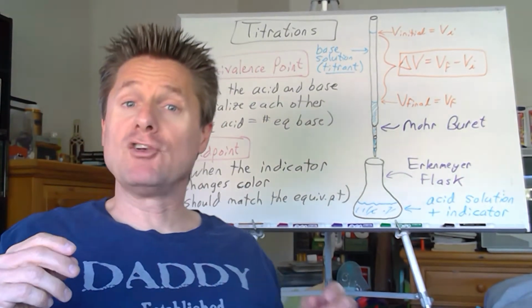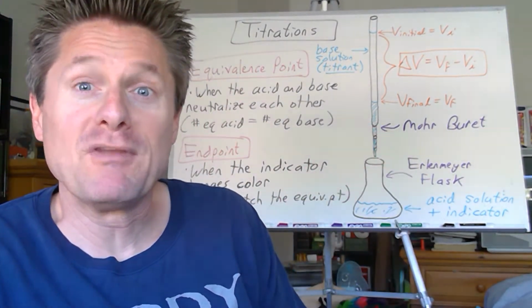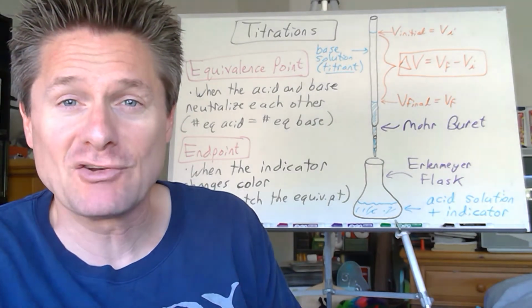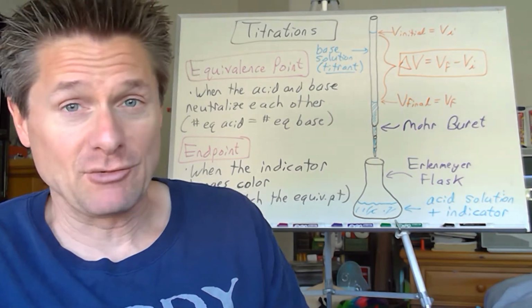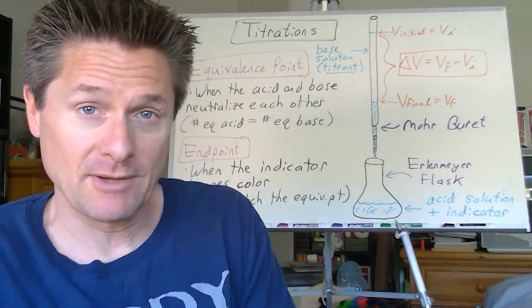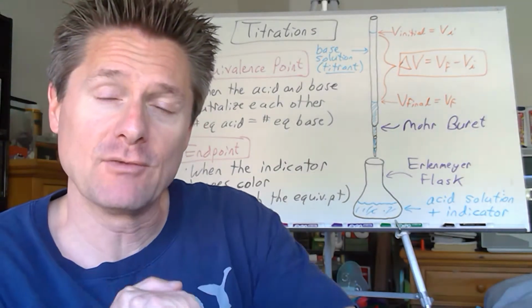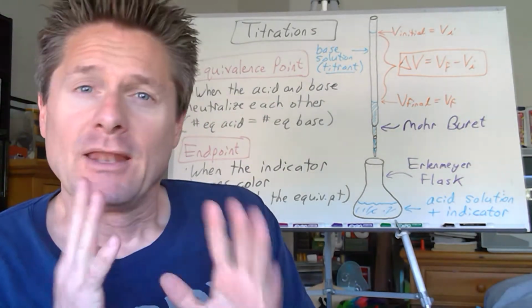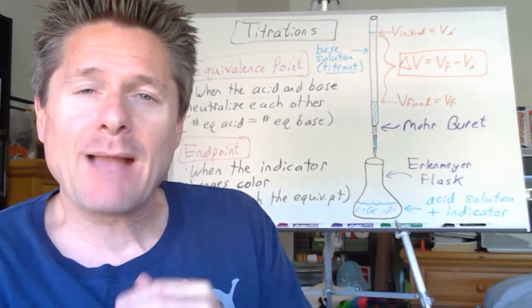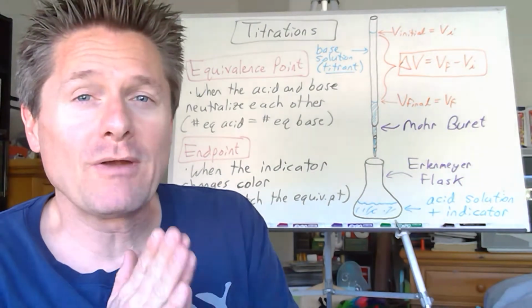So when we are doing titration, this is just a messy board here with a little review from last semester on what a titration is, which I'm assuming all of you did in introductory chemistry or first semester general chemistry, where you're just taking an acid and neutralizing it with a base using a burette. So we'll review that just briefly, get the common language back, blow some dust out of the brain, get you going again. But we're going to take it to a whole other level.